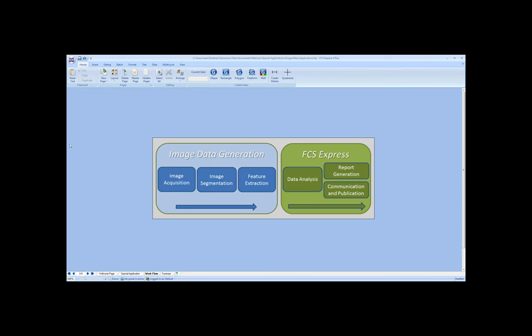Image segmentation software packages such as CellProfiler or ImageJ are used to define cell boundaries, and at this point we can read data from CellProfiler, from the Molecular Devices Velos instrument, from some benchtop devices from Chemometec, Nexcelom, the LifeTech Tali. We've also announced some collaborations again with LifeTech and with PerkinElmer.